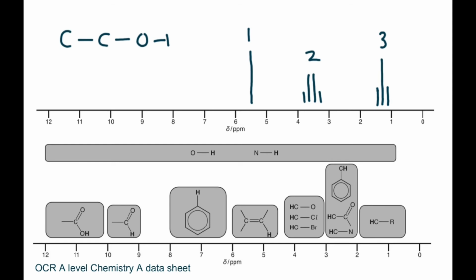We're particularly concerned about the hydrogens. So I'm going to very clearly draw my hydrogens on my molecule. It's not about the carbons anymore, it's about identifying the hydrogens. Now I've sketched this, and that's why the spectrum looks like that, because I've sketched it.